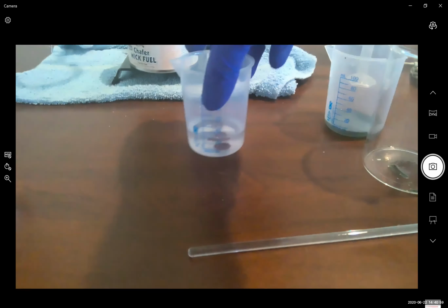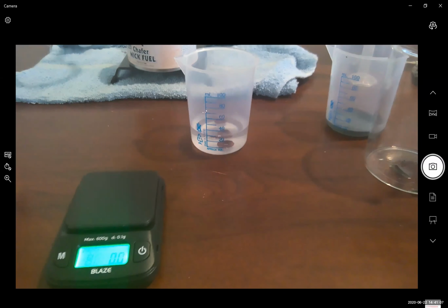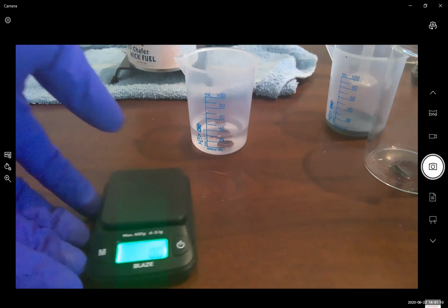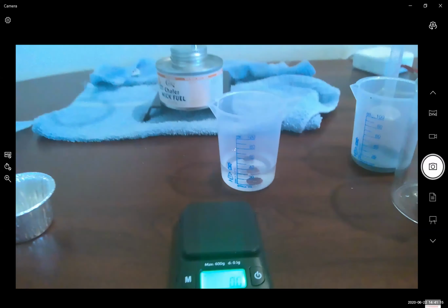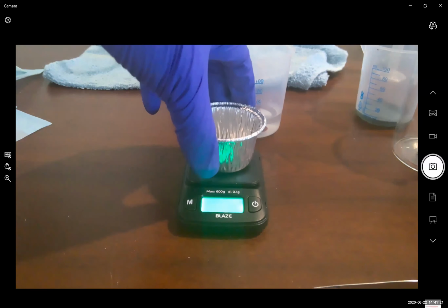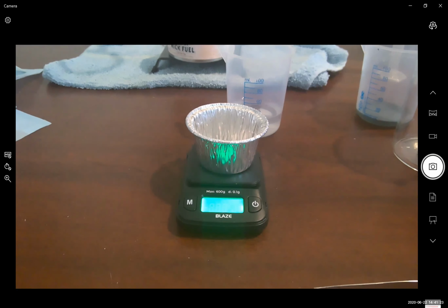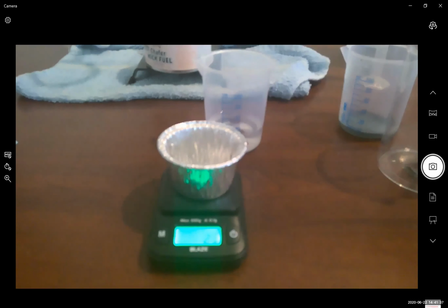Now, before we finish processing these, we're going to weigh out our aluminum cup that we're going to use to dry our copper. So here's our balance. Our balance is set at 0.0. It's zeroed out. Now we're going to place our aluminum pan on the balance, and record the mass of our empty aluminum pan in grams. So this gives us a mass of 2.3 grams for our empty aluminum cup.